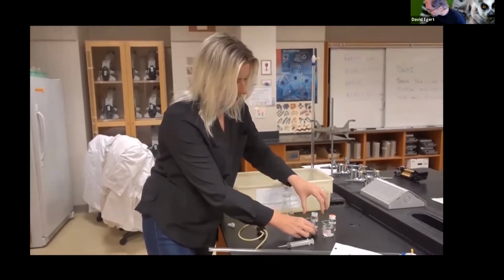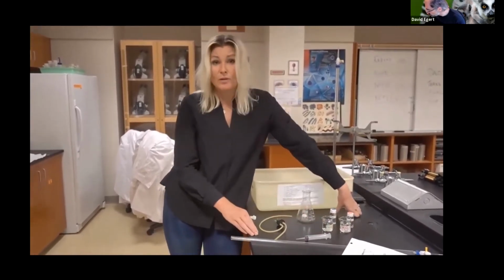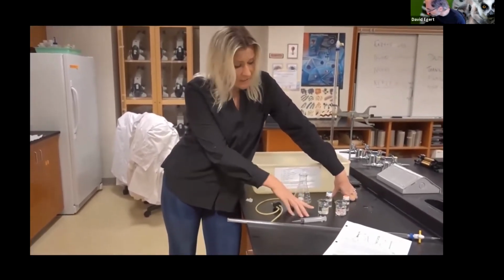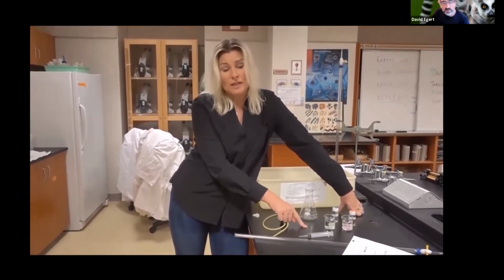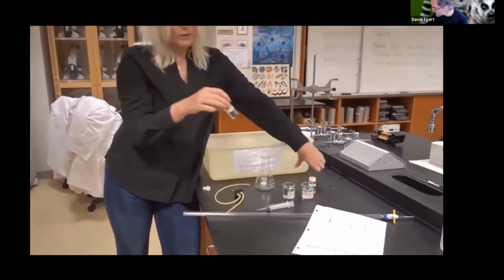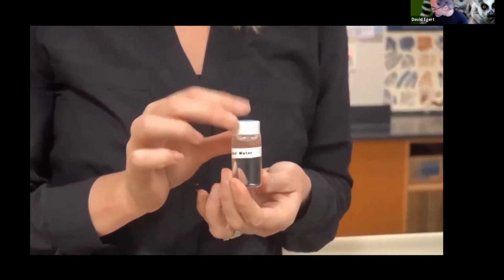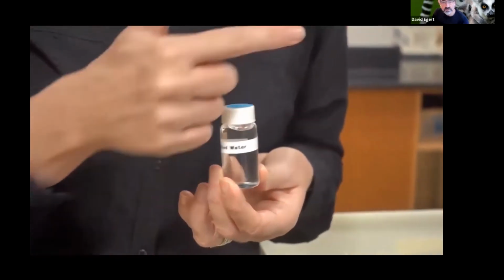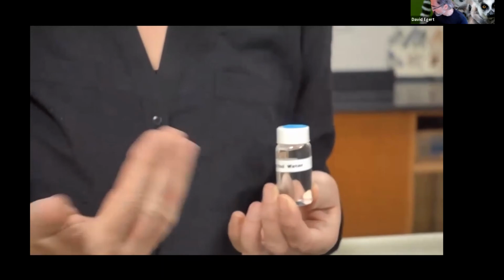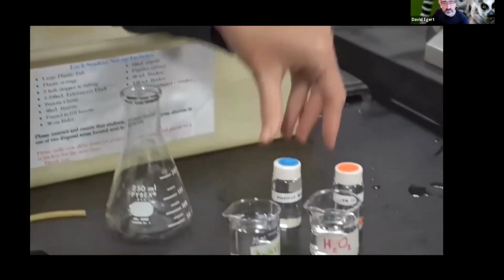The other thing that I think is pretty clear, if you just take a look at these 2 solutions, they both look like water, which means that you need to be super organized and label your containers. Even with these bottles, it can happen that you go over to the counter and pick them up, and a student in the previous section might have put the wrong cap on, or it's just not the right thing. So being super organized, keep it labeled.